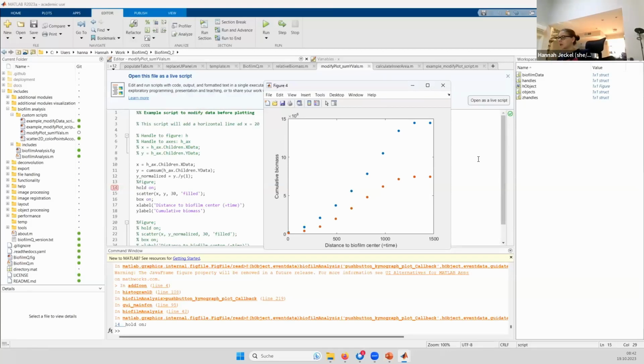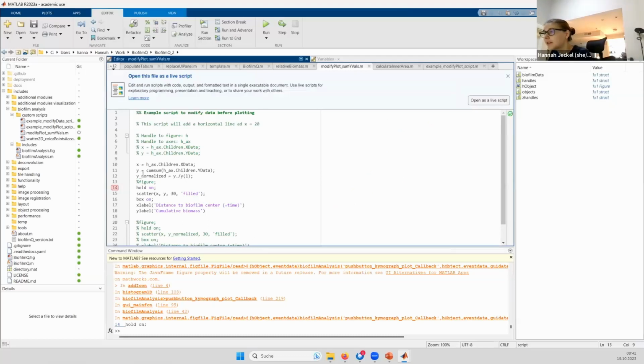This brings me a little bit closer to the question, which strain outcompetes which, but I still have this problem that in my very first time point, I already have a mismatch. And it might not look like much down here, but actually for values so small as the ones here, it can mean a big deal, which is why we're going to make one more modification to our script. And this is we want to have a normalized biomass. And what I do here is I normalize it to the first value.